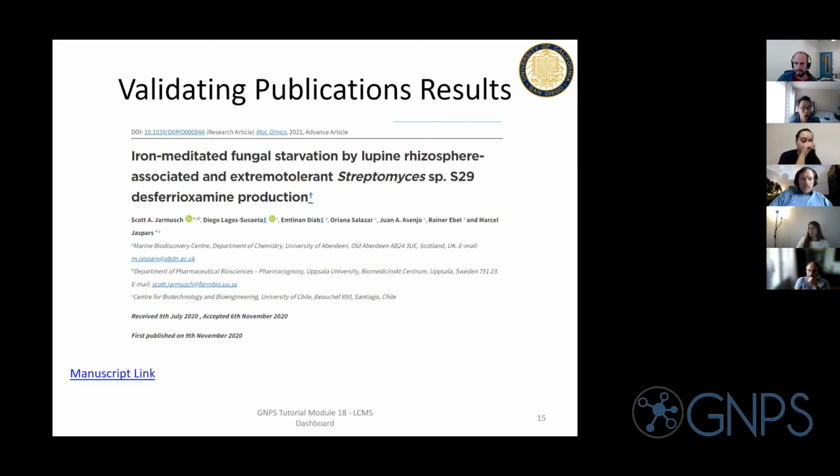And then finally, post-publication, what I'll show you here, is we want to change this culture about when you do reviews or evaluate the data of a manuscript, so that we make it really easy to start checking results. That, okay, the hypothesis posited by the particular manuscript matches the underlying data. And if that's important for your future work, you can at least start from a solid foundation.